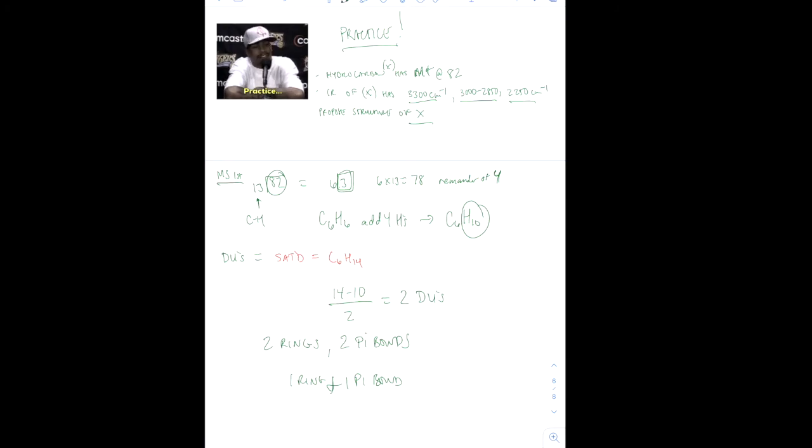Okay. Now, what we want to do is think about what functional groups are in this, and we're being told that based off of these stretches over here. At first, you're going to have to refer to the chart quite a bit, but that's why you have to practice, because eventually you won't have to look anymore.